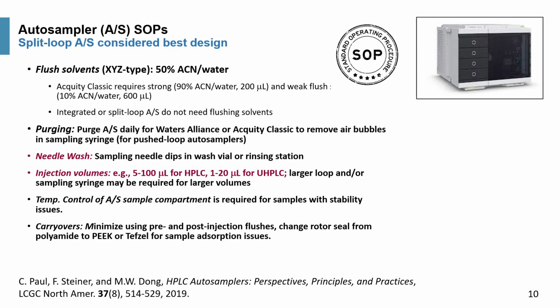Next slide, we summarize the autosampler SOP, mentioning that the split loop type of autosampler, split loop or integrated loop, is considered the best design with the best performance in terms of precision and also carryover.